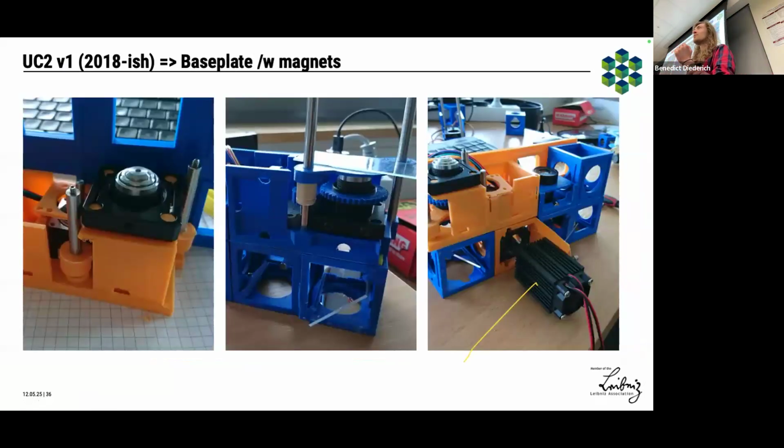And there were some cool papers. I think the first one I saw was called Cambits, so maybe it was even from Stanford, I'm not sure, where they put together a camera and something to focus the camera. It was also modular. I liked it a lot, and it was probably the inspiration for this. And here it was all magnetic. The base plate could attach them, but it was pretty fragile. I think building an interferometer would not be possible.